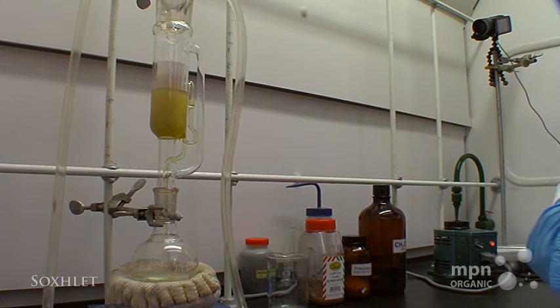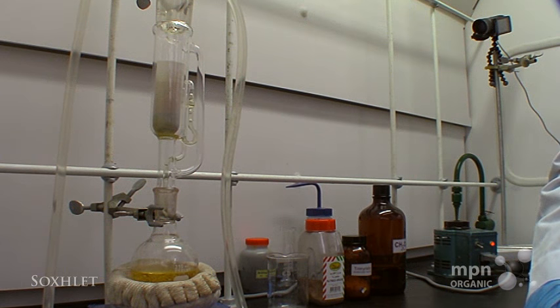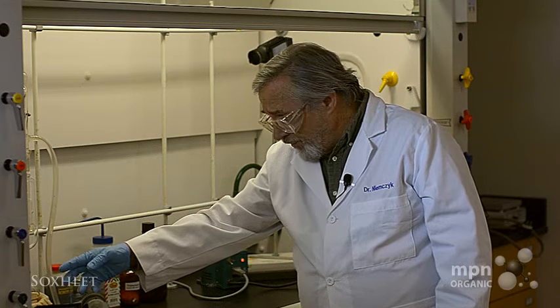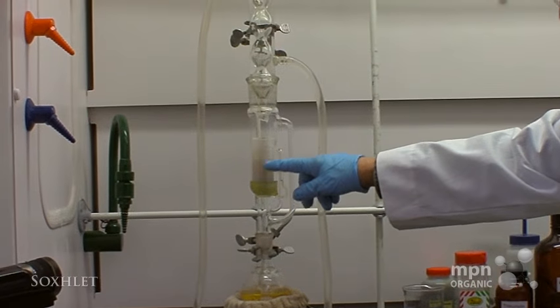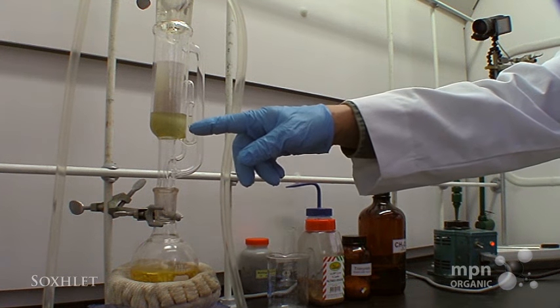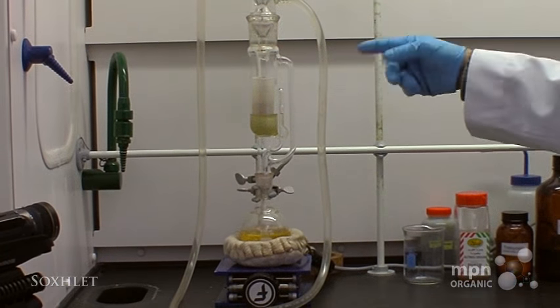Here it goes — you see, it empties, and then the cycle will start all over again. It's starting to fill up again, and it will reach that level, drain back down again and again and again.